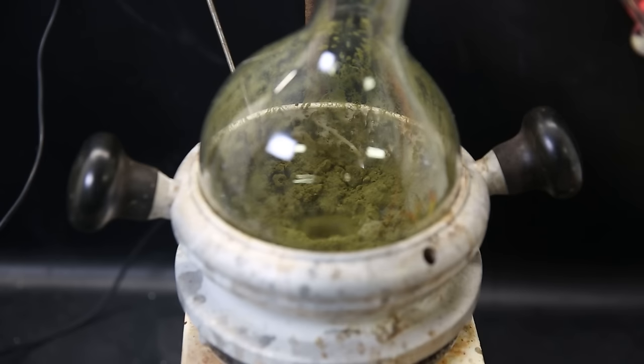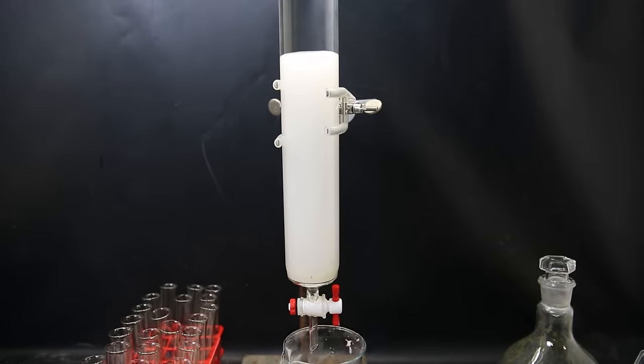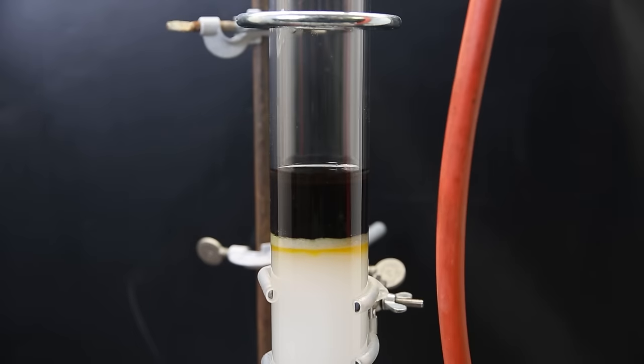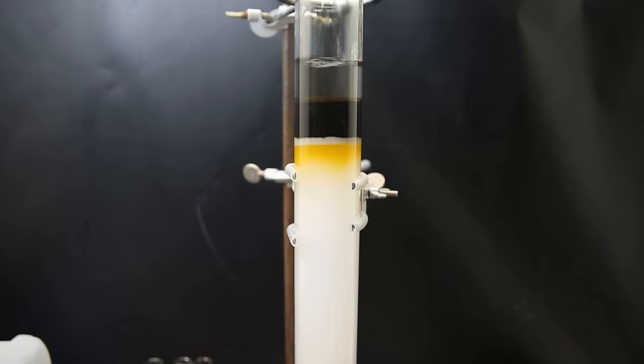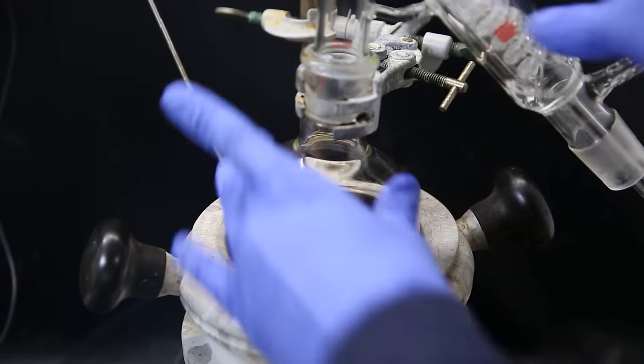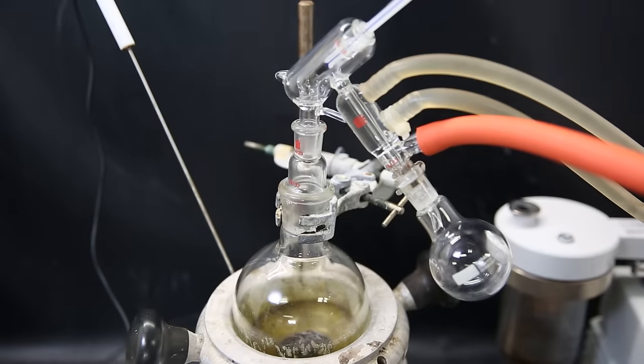was really annoying. I then dry loaded it all into silica gel and did column chromatography to try and separate out the Nepetalactones. But it ended in a catastrophic disaster, and I didn't manage to separate it out. So, after this had failed, my pride didn't let me abandon the project. So instead, I decided to defy nature and make it synthetically instead.